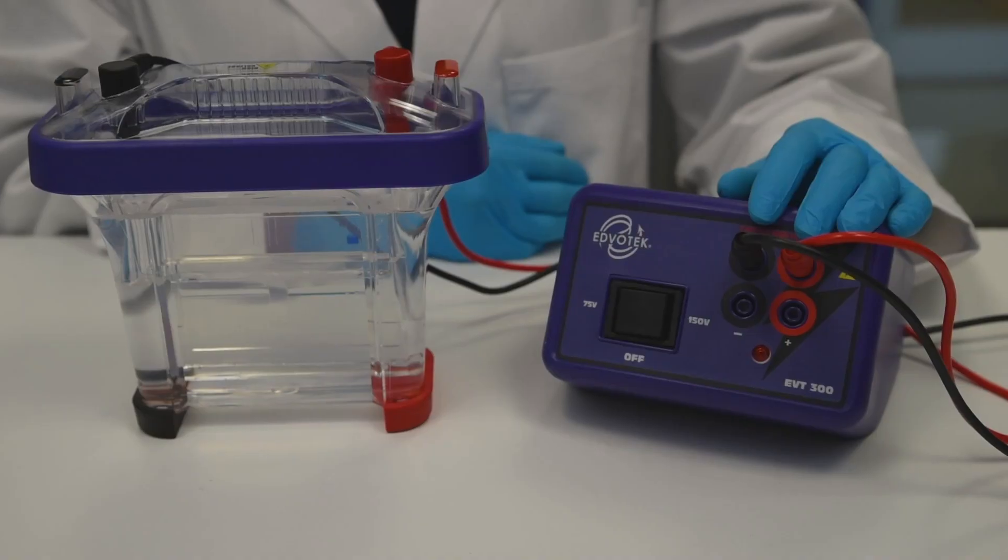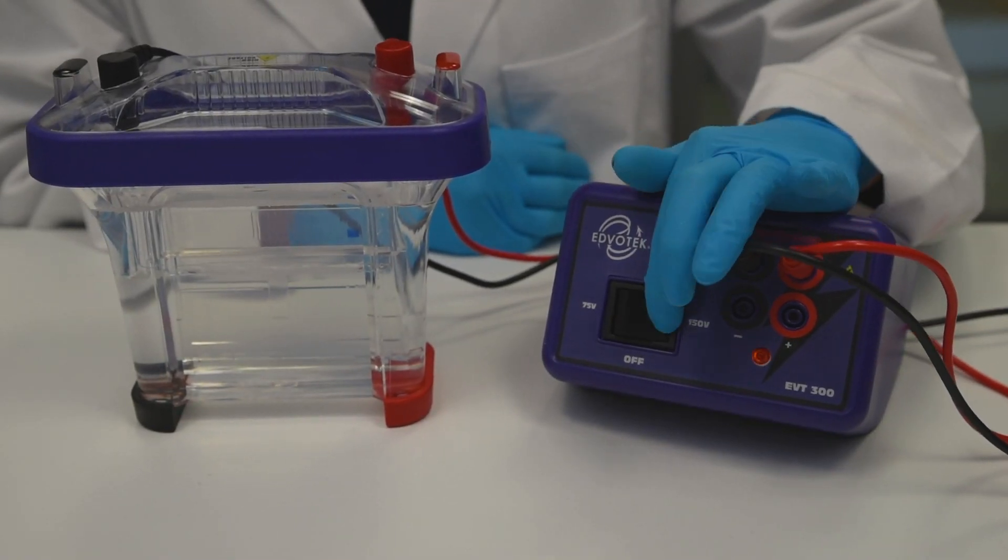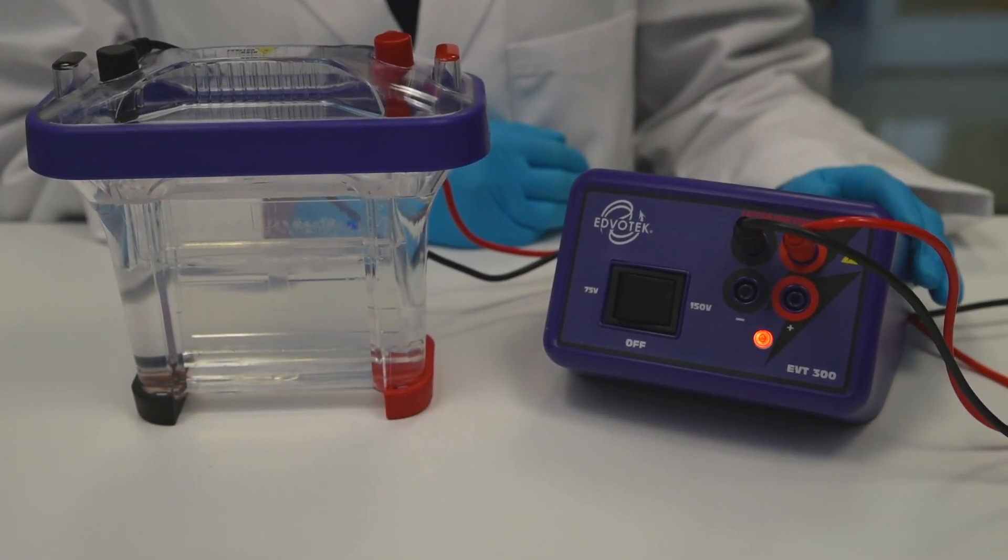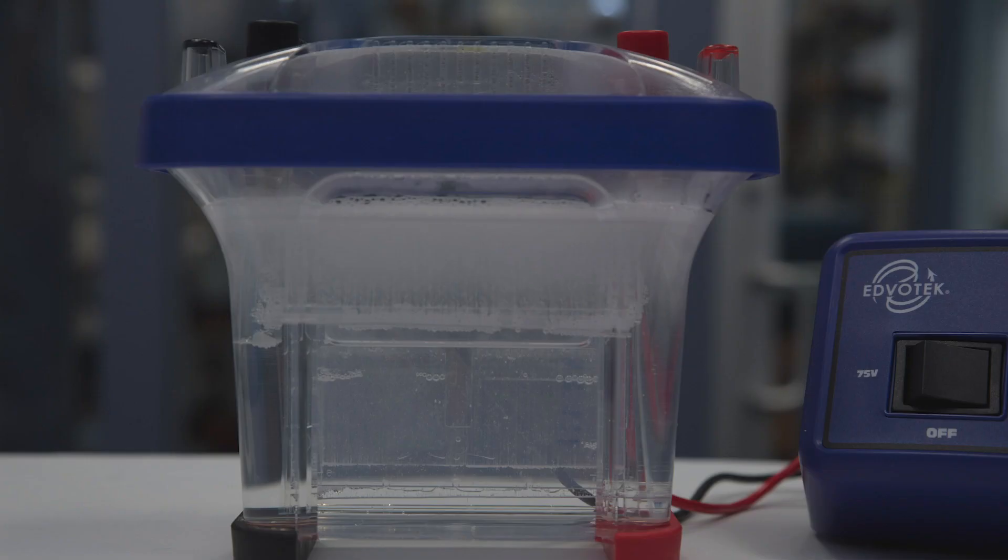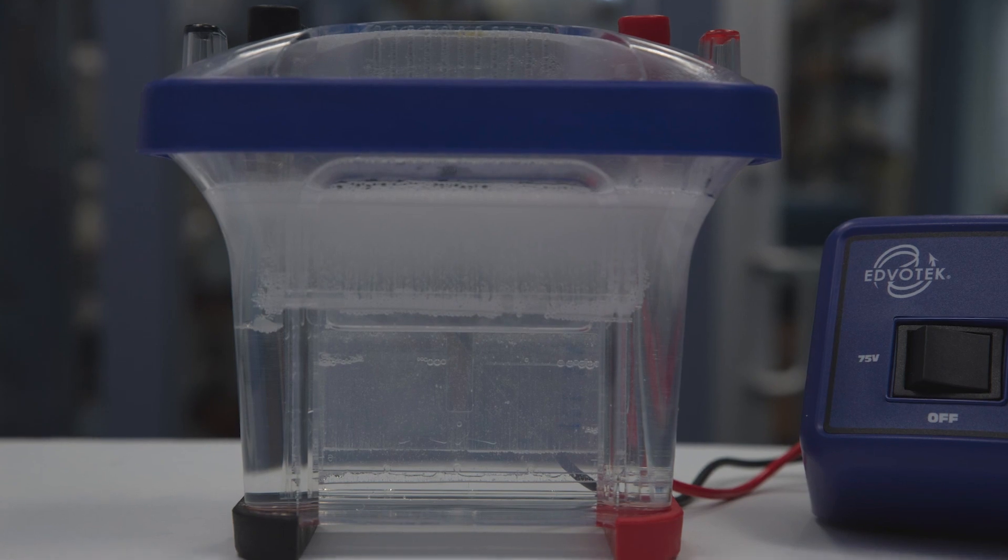Step 7: Set the voltage of the power supply and perform electrophoresis. Allow the proteins to separate through the gel for the recommended length of time, or until the tracking dye reaches near the bottom of the gel.